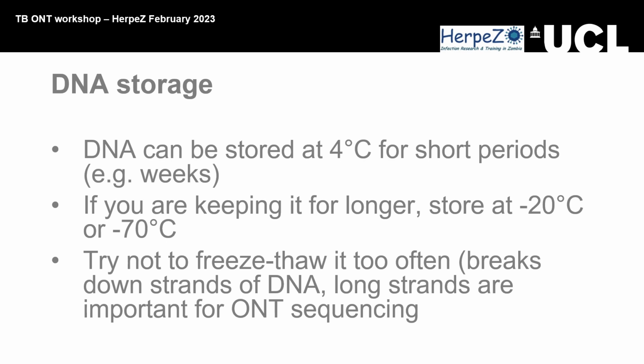Yeah. But again, remember, the other time we did 2 groups. Yes, the one that I did for 2 hours came out good, and the one that we did overnight didn't come out good. So I don't know why. We can look at that. Yeah, you've got to allow enough time for the DNA to reconstitute back into the liquid.